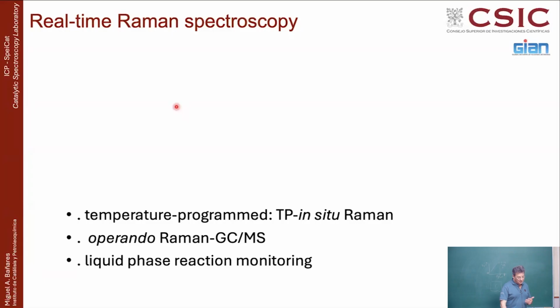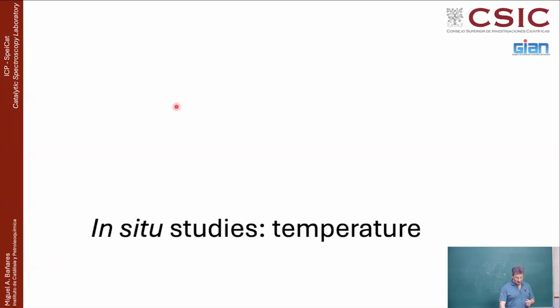And there are many things that we can do, and you will see during these days with Raman spectroscopy in real time, because the nice thing is that you are taking spectra within seconds and minutes, so that's pretty much real time monitoring. And we can make temperature programs, in situ studies. You can make operando Raman studies with online activity measurements by gas chromatography, mass spectrometry, infrared gas analysis, whatever. Or you can even monitor liquid phase reactions. We will be talking about these things.